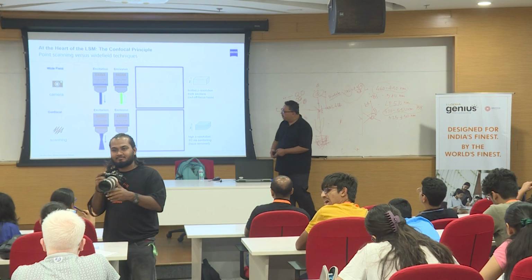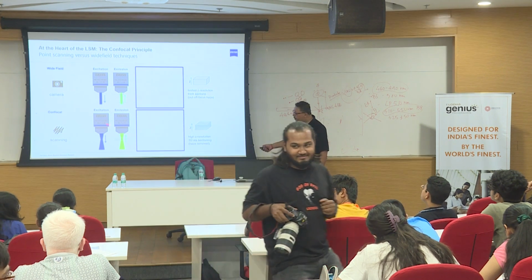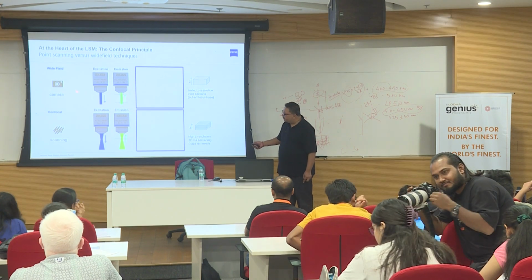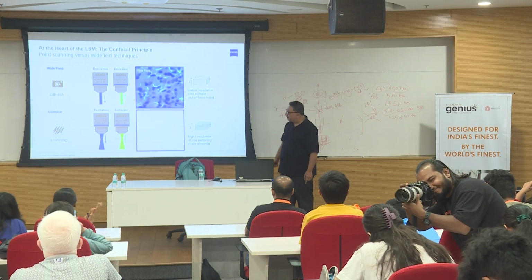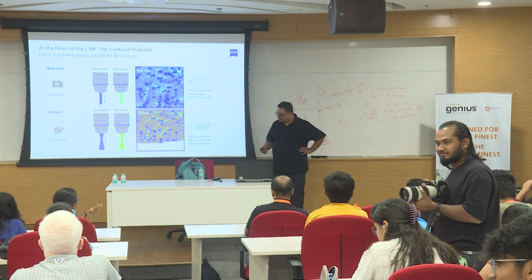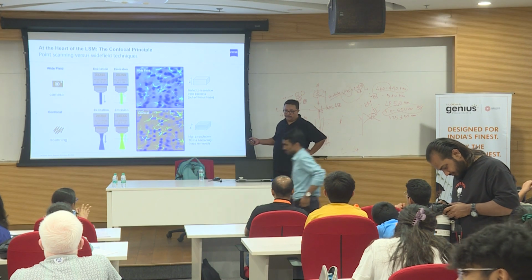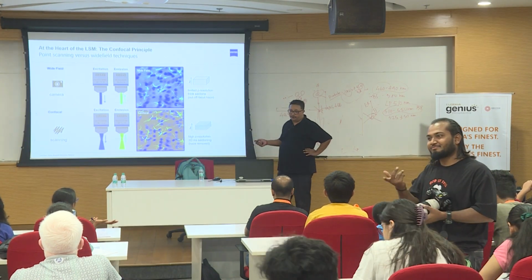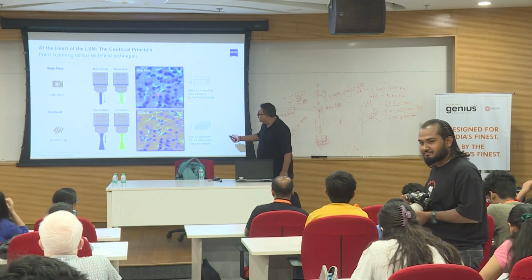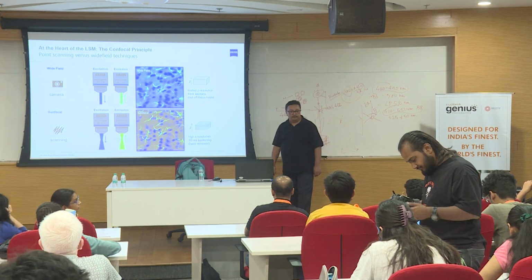So now, if you see these two images, the first image over here, what is this? Widefield. Over here, you have the confocal scanning. You can feel the difference between these two images. What is this image over here? Widefield fluorescence. A normal conventional fluorescence microscopy, where you see signal but a lot of haze also. A lot of unwanted information in the background which you can't resolve, and you never know which information is from which focal plane, right or wrong.